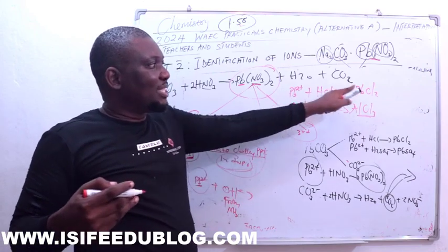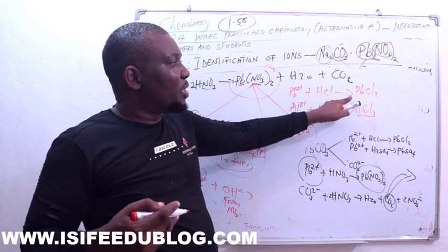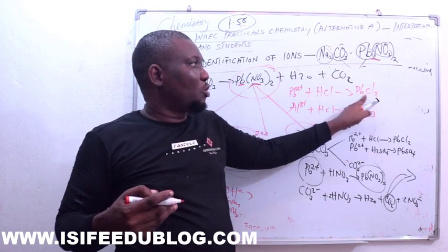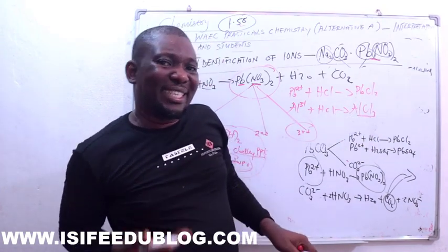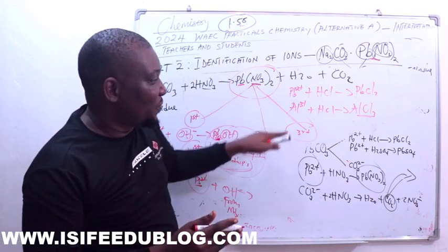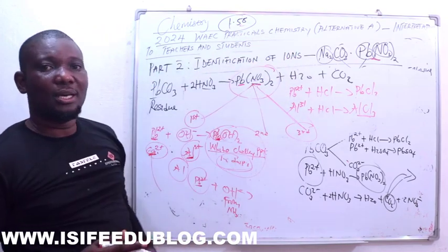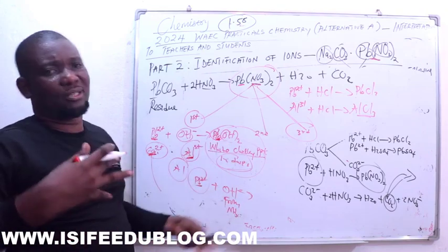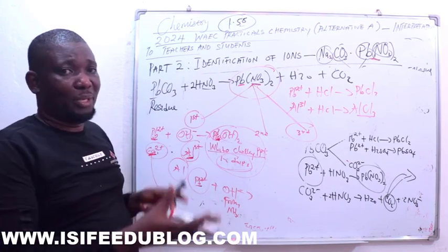On warming, the white precipitate formed becomes soluble and dissolves, but on cooling, it reappears as needle-shaped crystals. This actually confirms to us that this particular cation is lead. It's interesting that this practical is carried out this way, and that is how we are able to find out all of this.